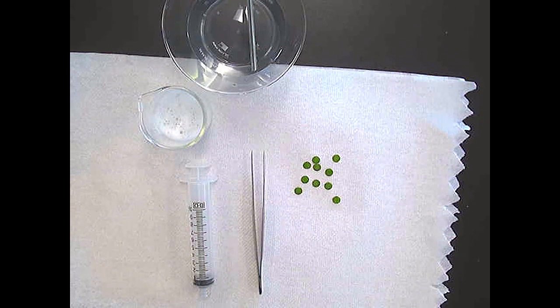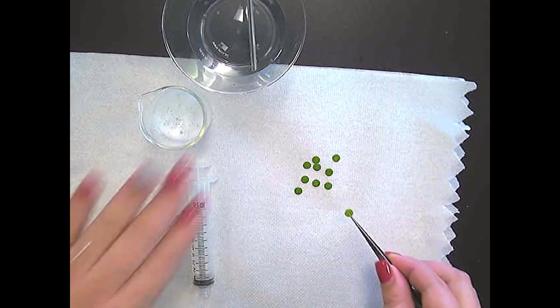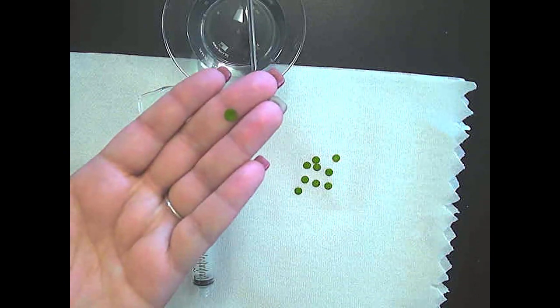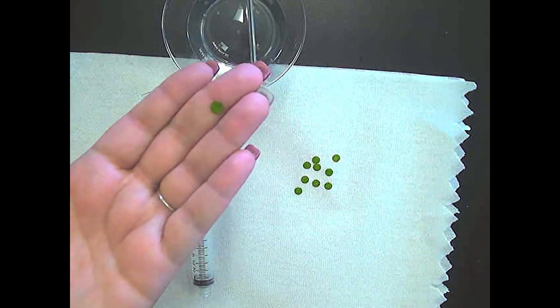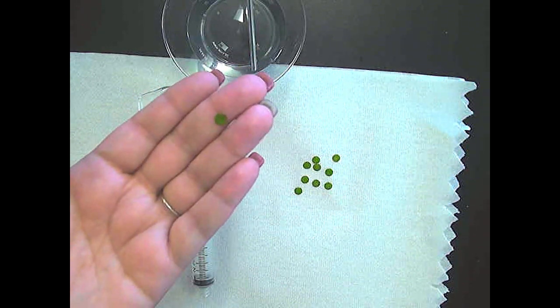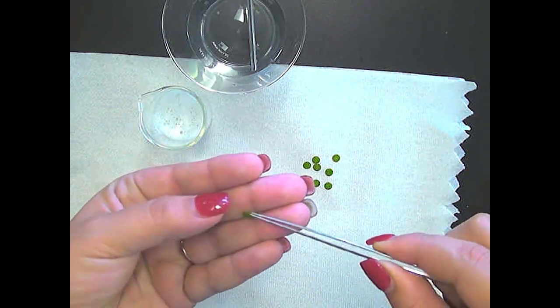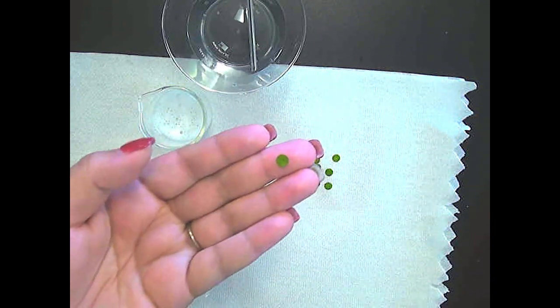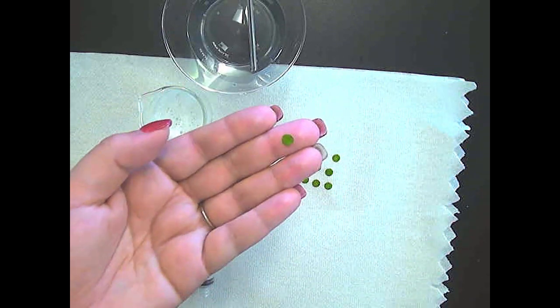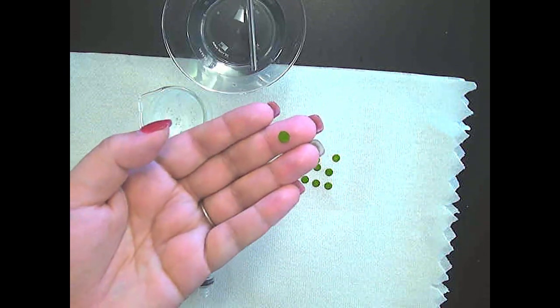So the goal of this experiment is to record the number of chads that are floating in your carbon dioxide solution. Chads are just these little discs made from living plant tissue, and inside the discs are pockets of air that were produced through photosynthesis. So we're going to first remove any air that might already be in the chad. We're going to shine light on them to encourage the light-dependent reactions of photosynthesis to take place, and record how many chads are floating at each minute interval during our investigation.